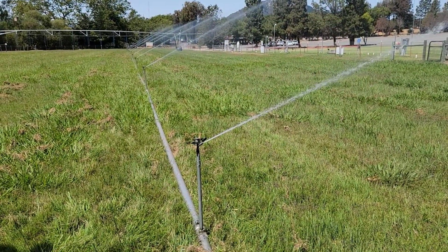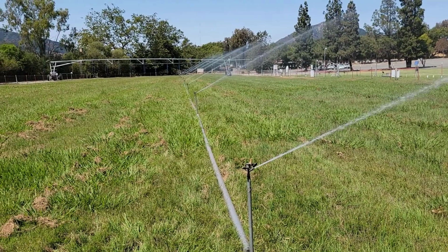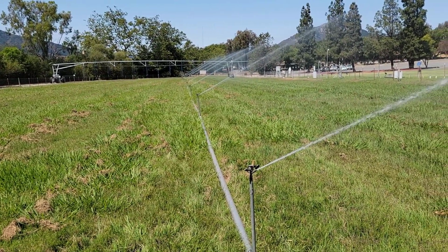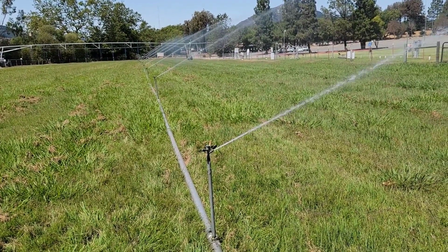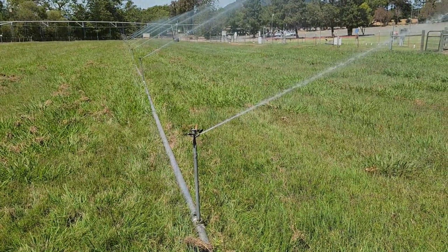Now that we have our sensors calibrated, we have to go outside to the field and get a sample of water so that we can develop the titration curve. The titration curve is important because it tells us how much acid we need to inject to achieve a given pH in the irrigation water.